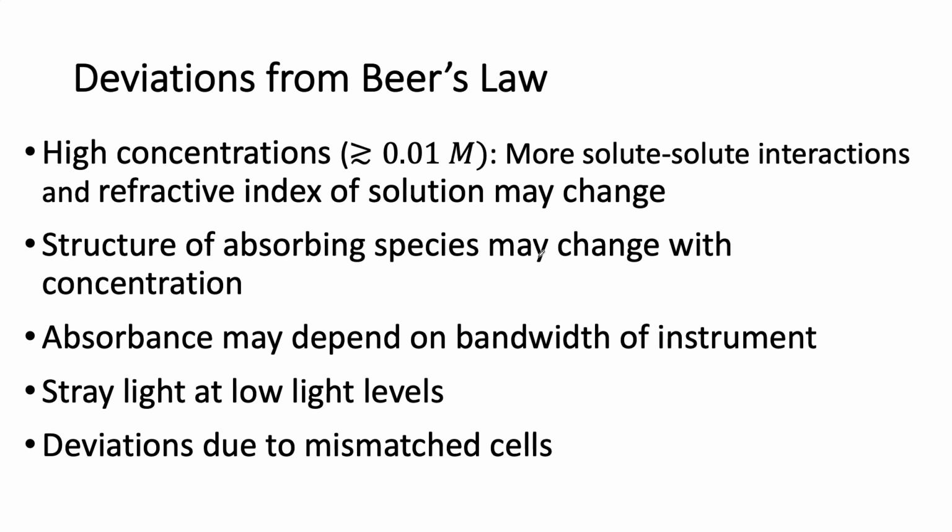First of all, you have to assume that the material is relatively dilute, on the order of 0.01 molar or less. Could be 0.0001, something very low concentration. Once you start to get above 0.01 molar, remember, pure water is 55 molar, so something that is 1 molar is pretty concentrated.